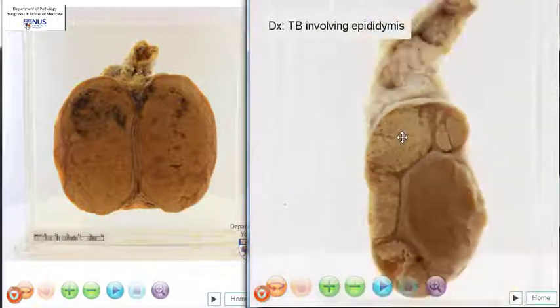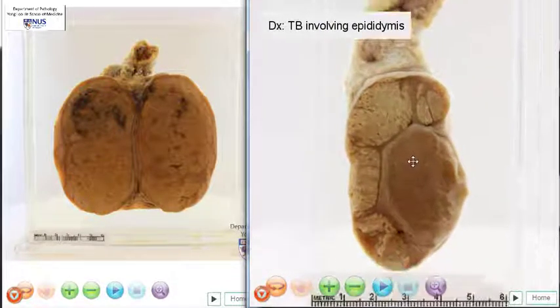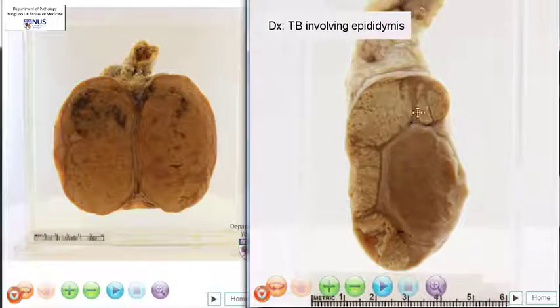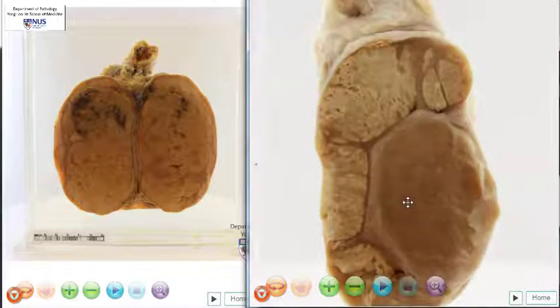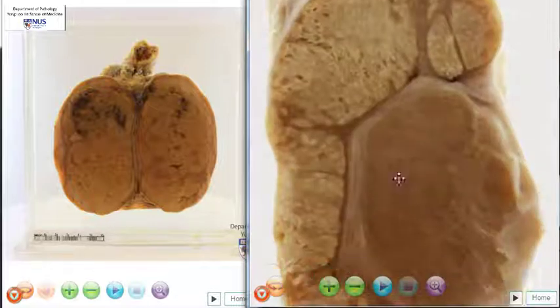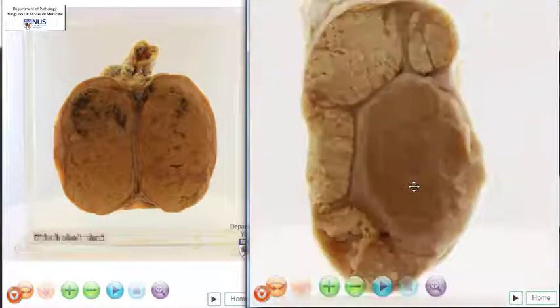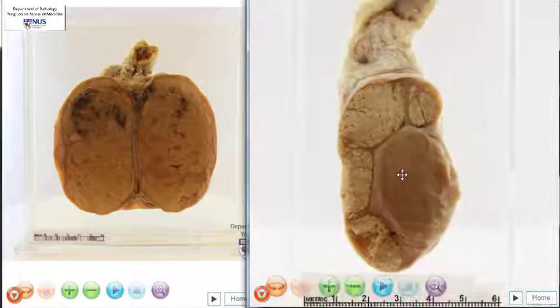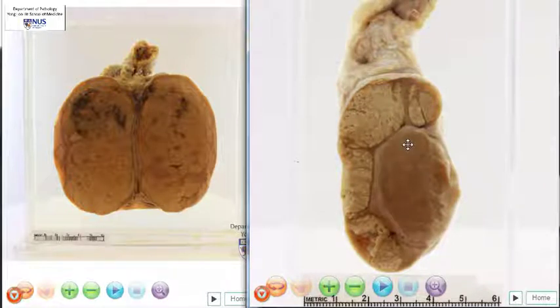So this is an example of tuberculosis of the testis. Interestingly, in TB of the testis, it often likes to involve the epididymis. If you look at the testicular parenchyma in this case, it really appears grossly normal. So sometimes the TB infection can spread from the epididymis to the testis, but in this case the testis is still as yet uninvolved.